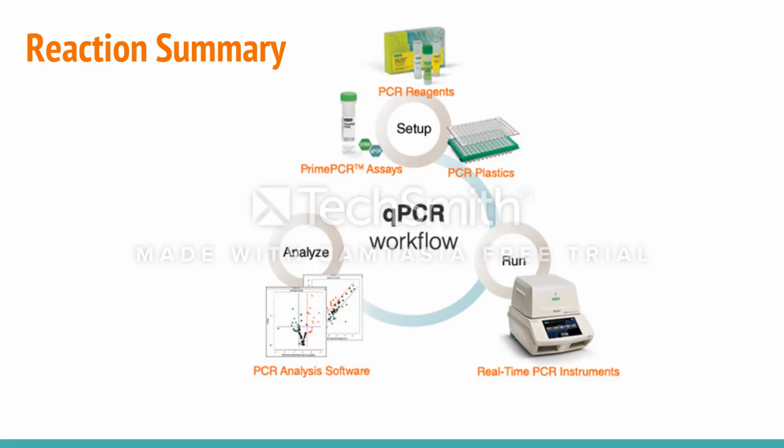Reactions are then run in real-time PCR instruments, and the collected data is analyzed by proprietary instrument software, which allows you to determine the initial number of copies of template DNA or the amplification target sequence with accuracy and high sensitivity over a wide dynamic range. Real-time PCR results can either be qualitative, where there's the presence or absence of a sequence, or quantitative with the particular copy number.